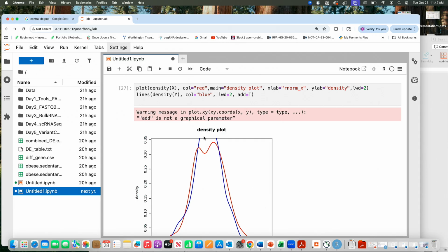Unless I use limit functions like the ylim function, it will use the threshold of my first data, whatever I am plotting first. In this case it is plotting x first, and then over that plot it is adding the second plot. So the x and y axes are already defined, which means the second data only gets whatever leftover space is there.